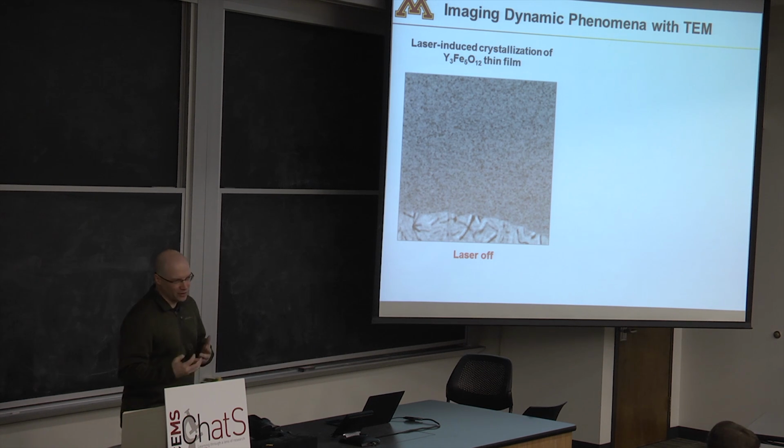But it was never really working very well, and it was hard to understand how it crystallized, why it crystallized, where it did, and so on. So we did some experiments where we took this glass, put it in our TEM, heated it up, and watched it crystallize, okay? Up on the top portion here, this chaotic, weak contrast region all through here, this is the glass. It's really nanocrystalline. It's not really a glass. If you zoomed way in, you would see tiny little crystallites of this material, okay?